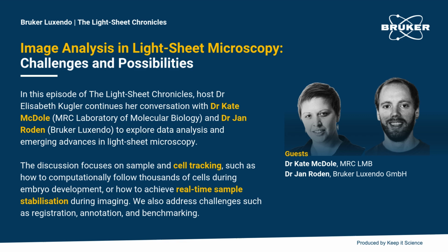The way we do this is that every time point during the acquisition, we run an image registration that detects whether the sample has moved and by how much. Then there's a configurable threshold where you can say, if the sample has moved more than this, then start to compensate for the movement with the stage. The software sends commands to the stage to move the sample back into the field of view. That's so much less sophisticated than what Kate was talking about with the cells.